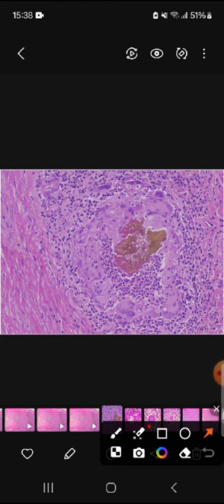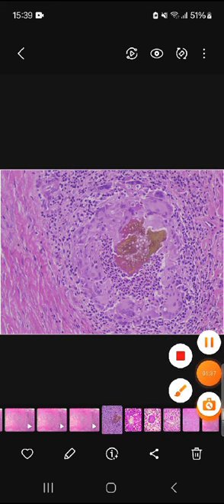Sometimes when there are pigmented fungi causing the disease, brownish areas can be seen, which are the septate fungal hyphae with hyaline budding, surrounded by multinucleate giant cells, neutrophils, eosinophils, and lymphocytes. Thank you.